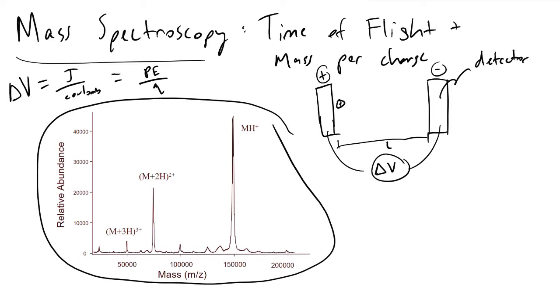If we examine some ion that we just created with our laser in MALDI earlier, when it is at the plate side on the opposite end from the detector, there's going to be a potential energy difference between these two sides, PE. We can evaluate PE quite readily by solving for PE equal to Q times your voltage, which I'll call V, or delta V.